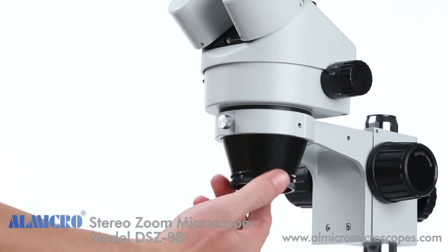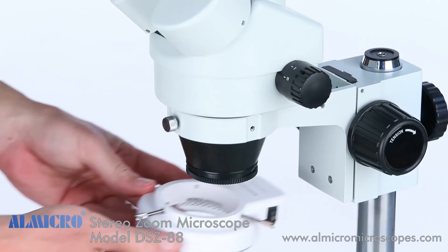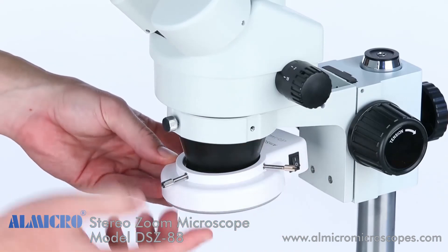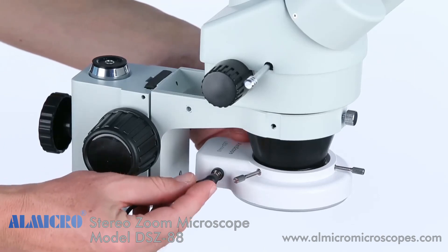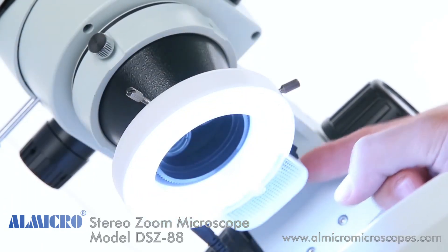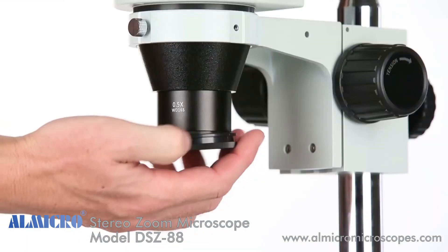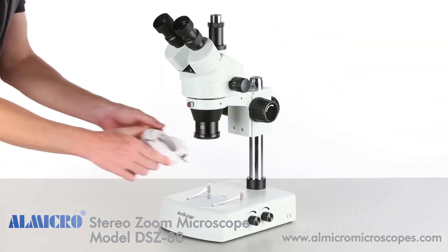Another popular accessory is an LED ring light. The first step is to screw on a threaded adapter ring, which will hold the ring light in place. The ring light is attached by fitting it over the adapter ring and then tightening three locking screws. Attach the power cord and we're ready to go. A ring light can also be attached to each of the Barlow lenses; the 0.5x Barlow lens has a threaded port — simply screw on the threaded adapter ring and then mount the ring light.